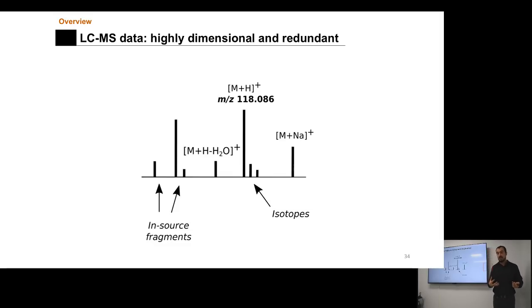And so, although we're using ESI, electrospray ionization, which is a soft ionization technique, we're going to see some fragmentation. And this is actually an existing phenomenon. In fact, common losses are observed as a result of insource fragmentation. They're not fragments per se, but they occur as a result of insource fragmentation. So, as I say, for one metabolite, we have different peaks.